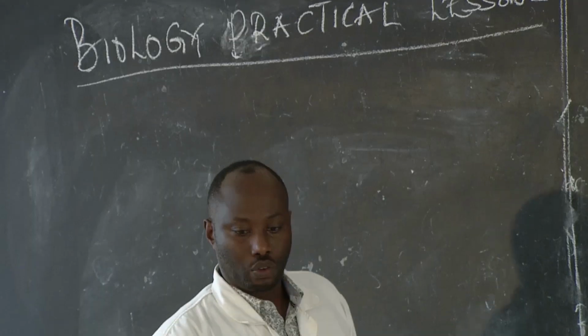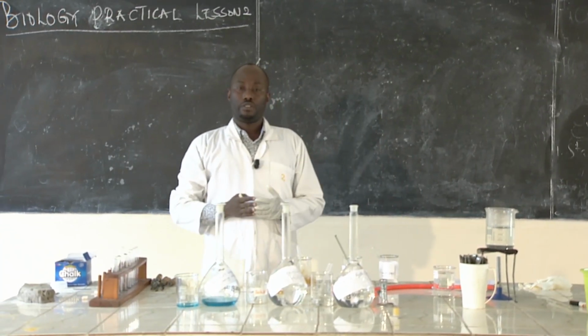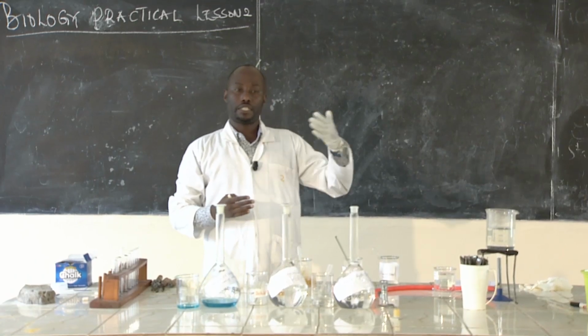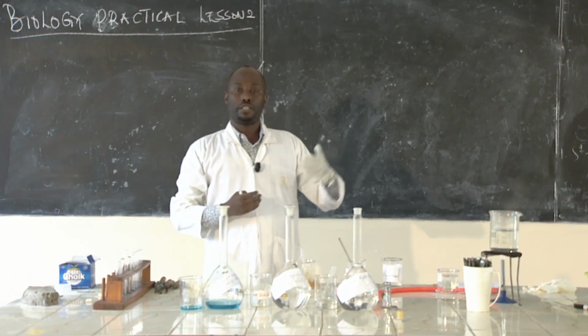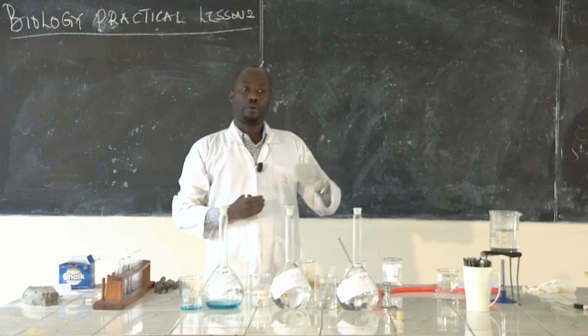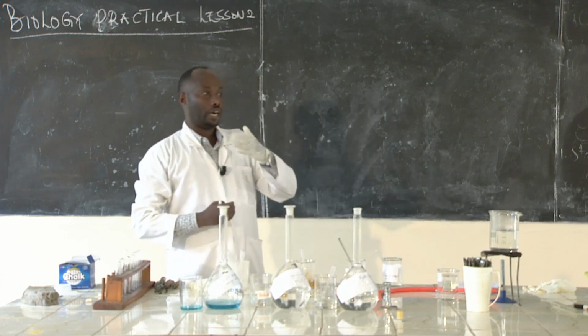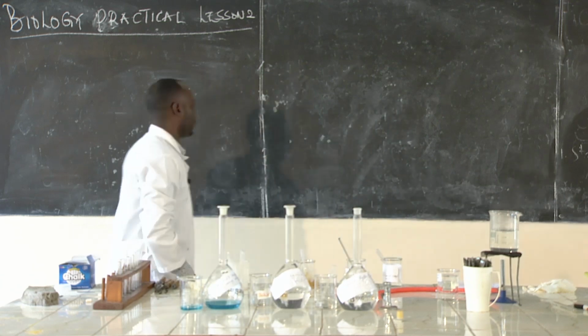So in the biology practical lesson of today, we are going to test for the nutrients. I think last time we discussed testing vitamin C, we talked about testing fats, and now we're going to test for reducing sugars and non-reducing sugars.